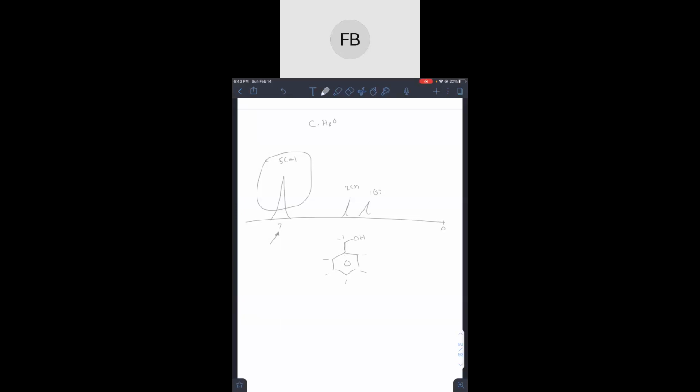And this still counts as a singlet. This is still a singlet, because this hydrogen is different than if it was attached to an adjacent carbon. So that still makes it a singlet. Basically, there are no adjacent hydrogens. So that must be the part that you were confused at, because you were like, wait a second, that would be a doublet. Yeah, but it's not a doublet. It's still a singlet because that H doesn't count the way that other hydrocarbons do.